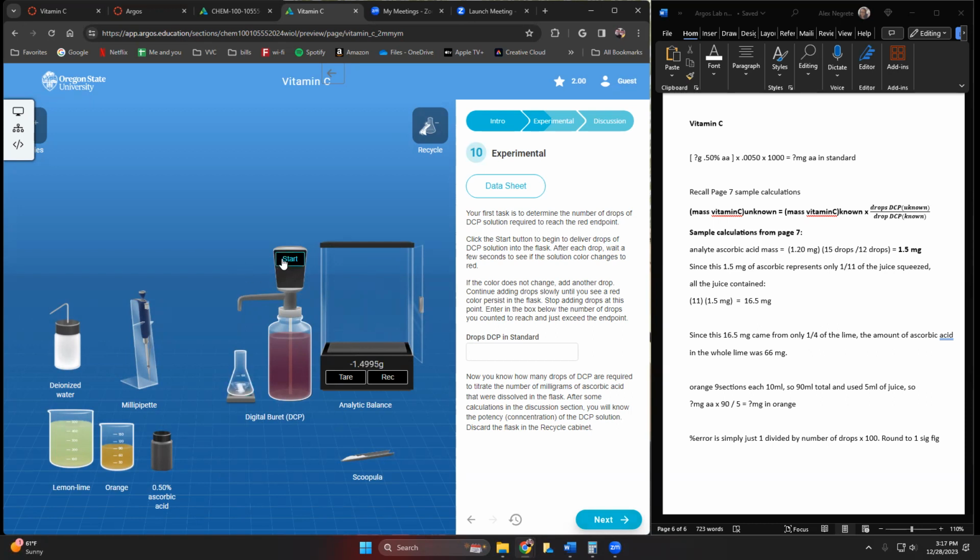And when we're ready to start the titration, don't quick start and stop, because it does take a few seconds. This is going to do a few drops every 3 to 5 seconds. We're not going to see an initial drop once we hit start. We just have to give it a little time, and you're just going to count the number of drops. So we go here, you'll notice nothing started yet. Don't panic. There it is. There's the first drop. And we're looking for this solution to change color. So it's going to be a color change to something like this.